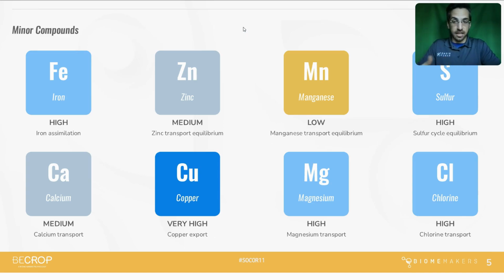These nutrients, if they're naturally very well exchangeable in the soil, this may not be preventing your crop from getting them. But if you're seeing deficiencies in a nutrient and you see low to very low scores here, biology may be very likely to blame. It may be cause for inoculation, use of organic acids, stimulation of the microbiome with carbon sources.